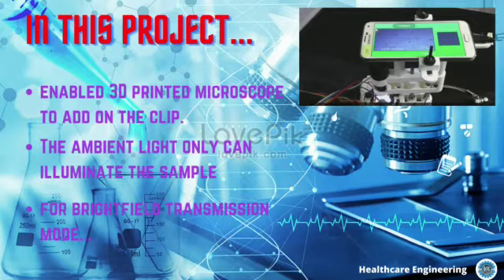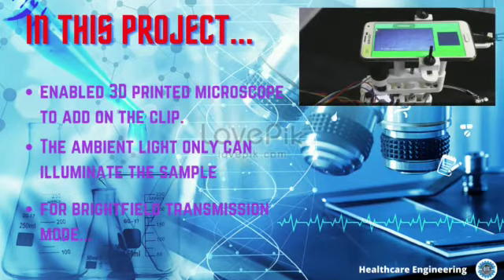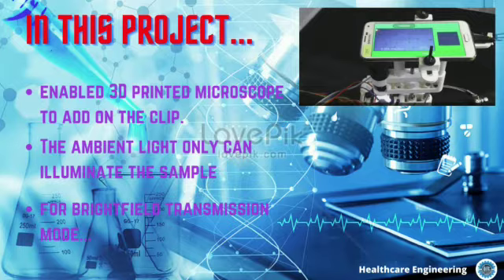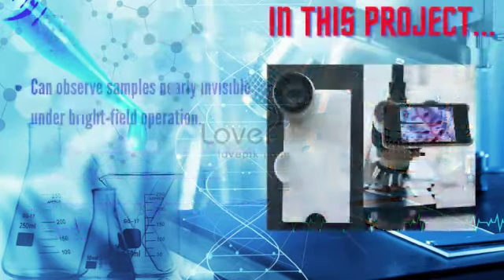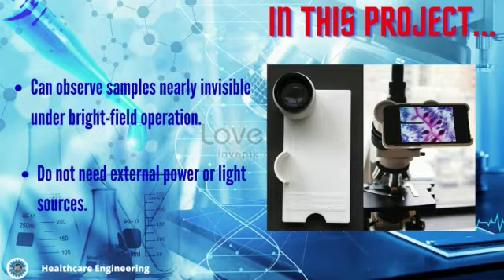For bright-field transmission mode, our design takes advantage of the integrated phone flash together with diffuse reflection. The 3D-printed device itself has the necessary geometry to create diffuse transmission illumination without employing an external diffusely reflective object behind the sample. Moreover, dark-field imaging is made possible by designing the clip so that ambient light only can illuminate the sample via internal reflection within the sample glass. As a result, we can observe samples that are nearly invisible under bright-field operation due to low absorption or refractive index contrasts, such as cells in media, because this design requires no external power or light sources.